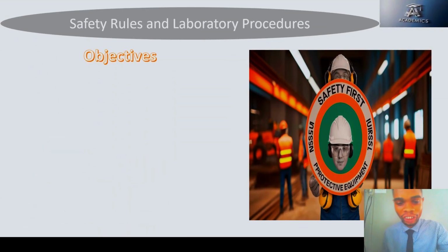The importance of safety in the laboratory can never be overemphasized. Like they always say, safety begins with you. So in this video, I'm going to teach you some of the safety rules you must apply whenever you are in the laboratory in order to avoid any hazard.